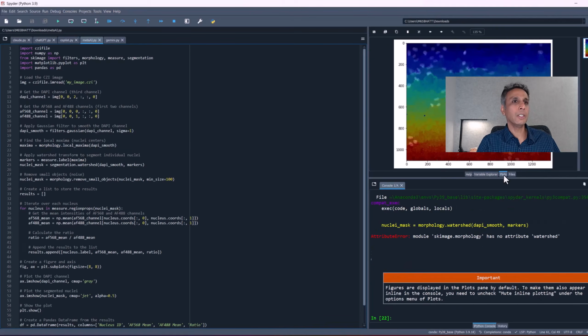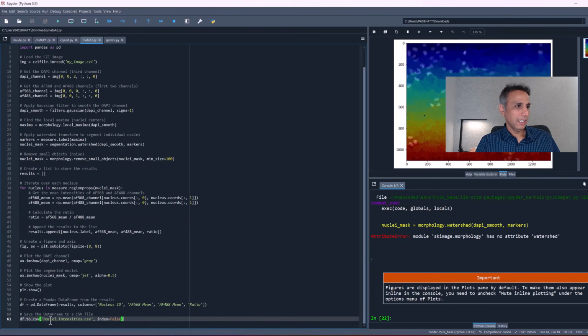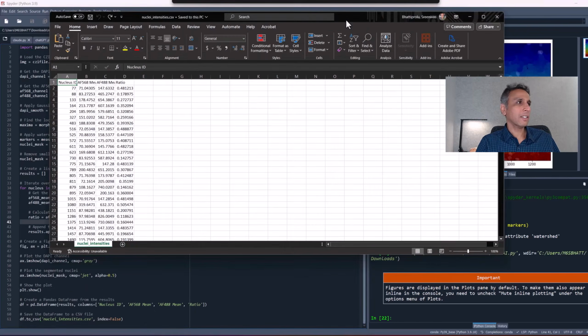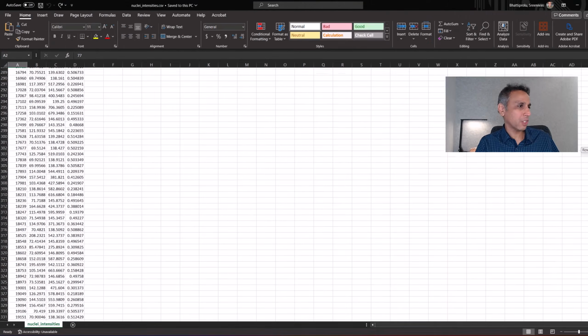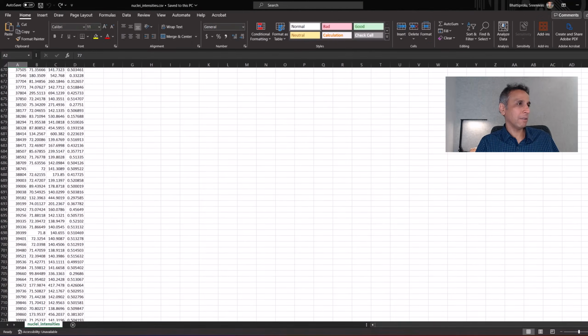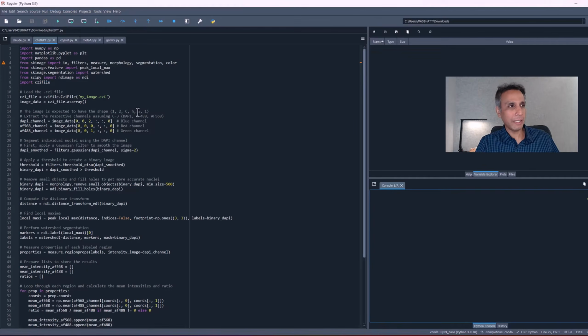But it did not segment what it needs to segment. Looks like it segmented the background or something, not the nuclei. And it reported intensities, and it did something. I think I have like 110 nuclei or 114-ish, but this thing is giving me 39,000. So obviously it's segmenting the background, thresholding the background and all that.